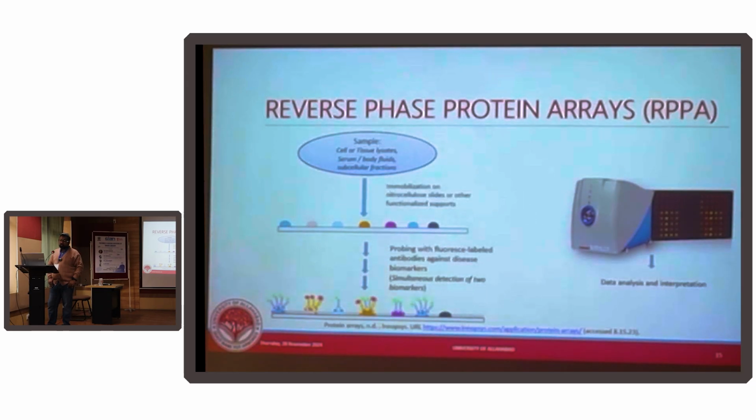The reason they are very costly is because they use monochromatic lasers. The laser I'm using is very cheap, because if you look at the wavelength, it might look green to you, but these are not perfectly monochromatic. So monochromatic lasers are one reason why they are costly. With the camera that they use, you get extremely high resolution. These are microscopic slides, but when you get the actual image, it's almost a 45 MB file, and you can zoom into a 2-micron dot, and it appears like a circle or a bar. So that drives up the cost.